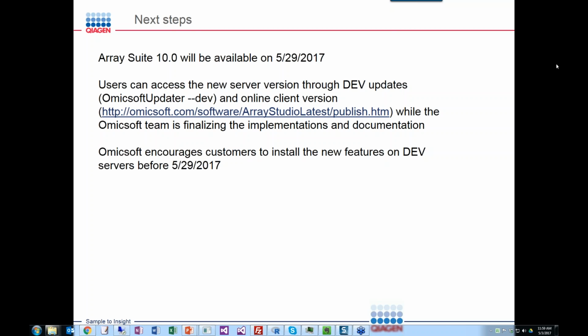Okay, and the last question I would like to touch on is about plans to expand support to other omic data other than genomics and transcriptomics. In practice we mostly work on genomics and transcriptomics, but most of the modules also work on proteomics and other data types. And actually we are the gold standard for metabolomics as well. If the user can ask more details regarding what type of data, we will be happy to discuss these opportunities. So I think that's it.